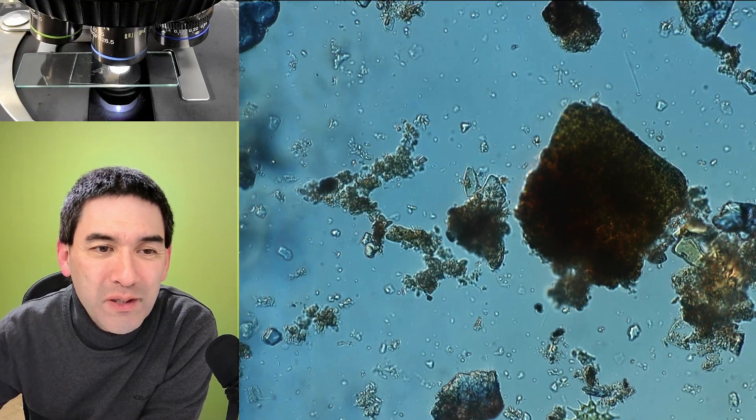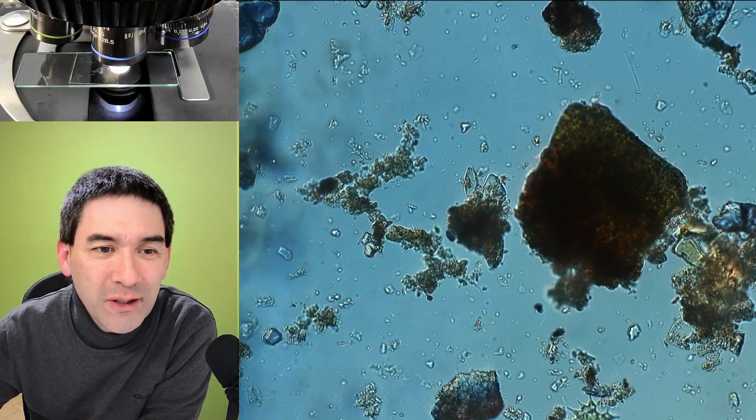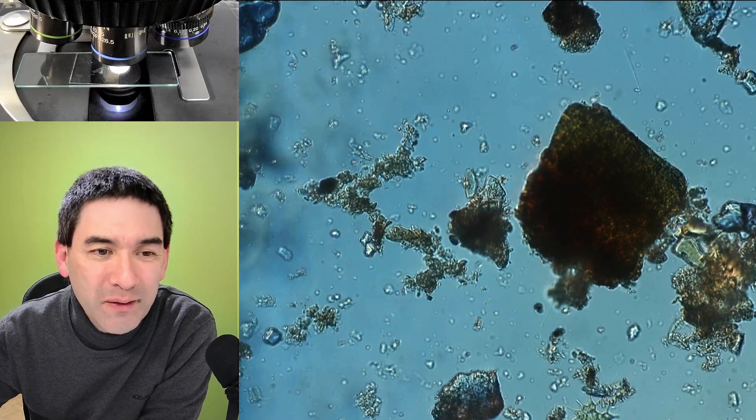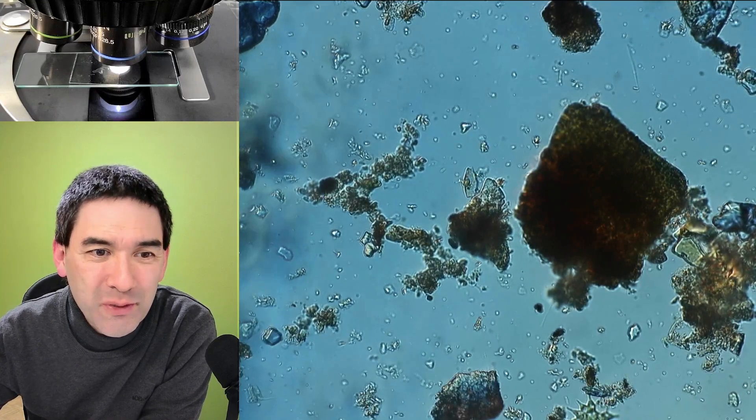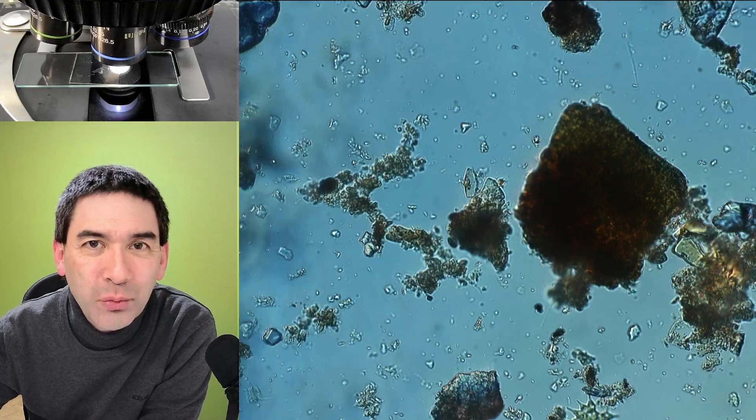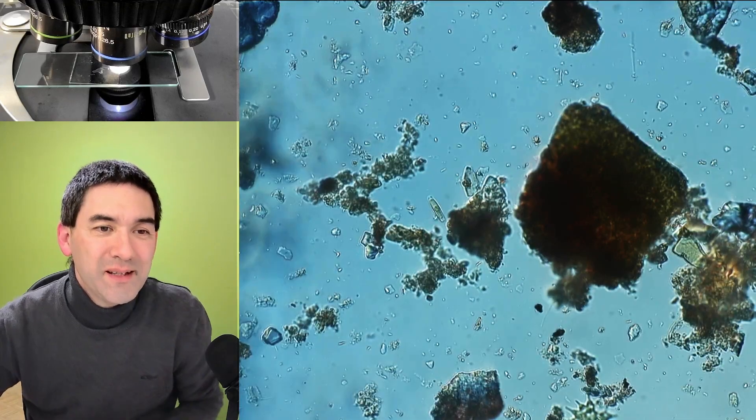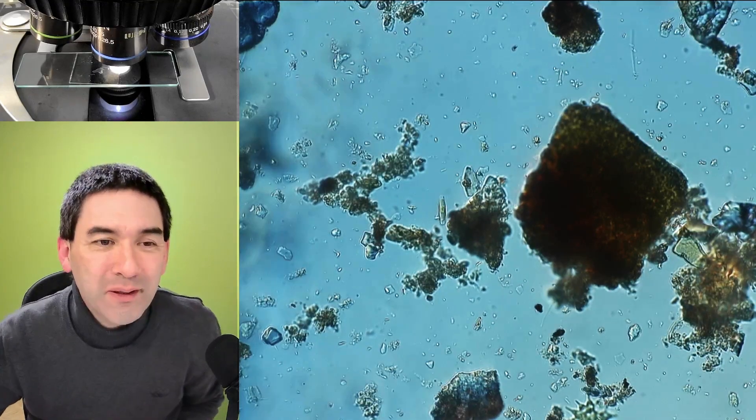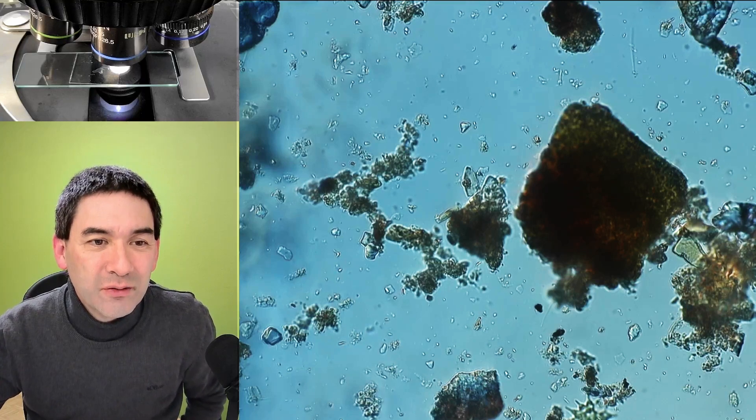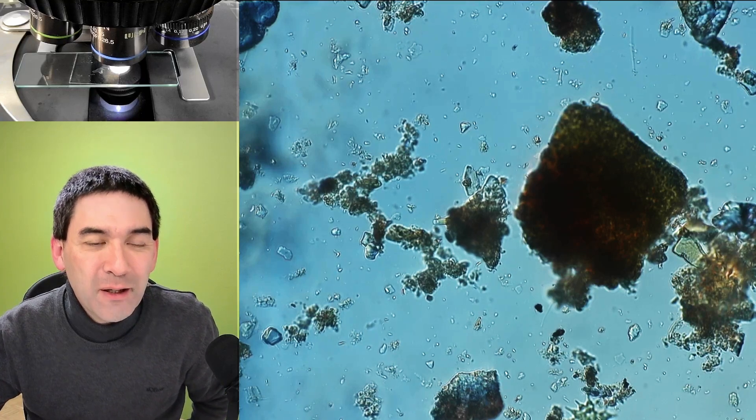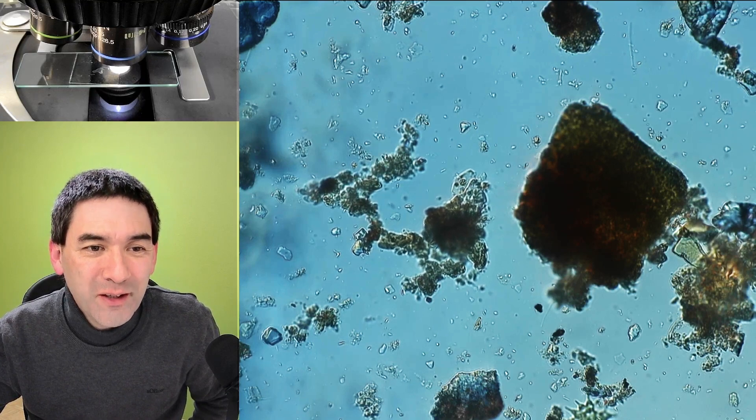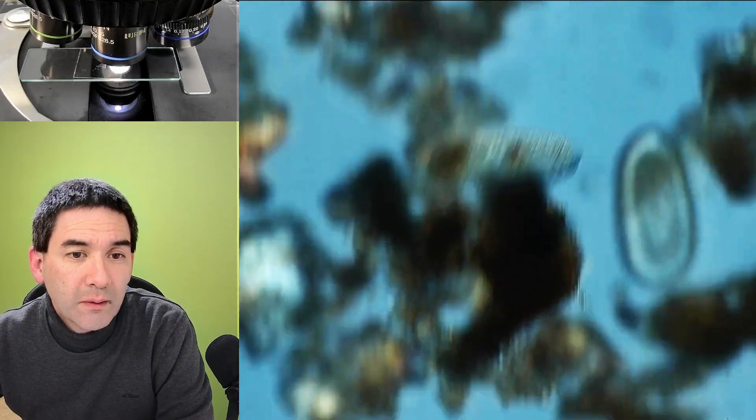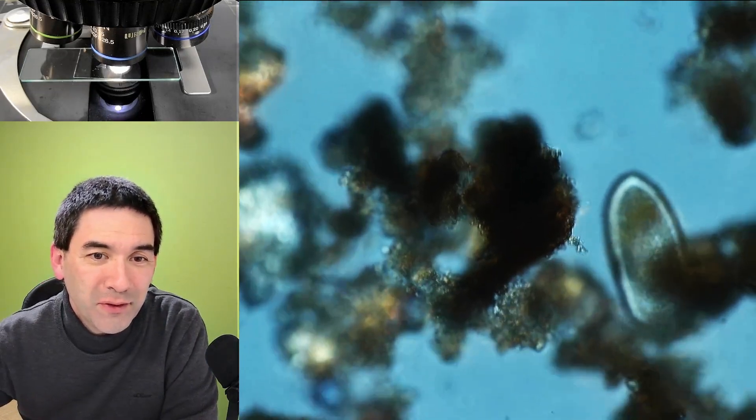Right here in the center a couple of moving sand grains or algae or simply some decomposing material, let's wait and let's find out what it is. And yes now we know what it is, it's a diatom, a tiny one you can see right on the left side. And this tiny diatom was pulling along this huge particle.